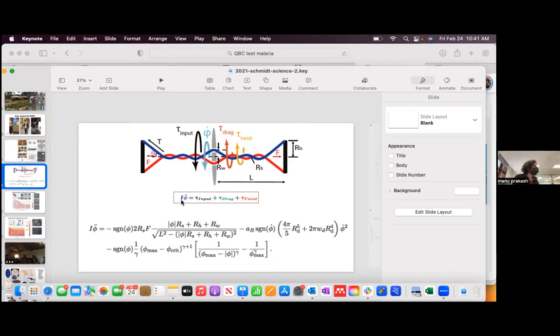So by definition, omega has to cross over the 0 point. And so what we have is an oscillatory centrifuge, but forces on all the particles that are making it move are oscillatory. And we've actually been thinking about when you have oscillatory forces, could you do new things in centrifugation that you can't do with constant forces?